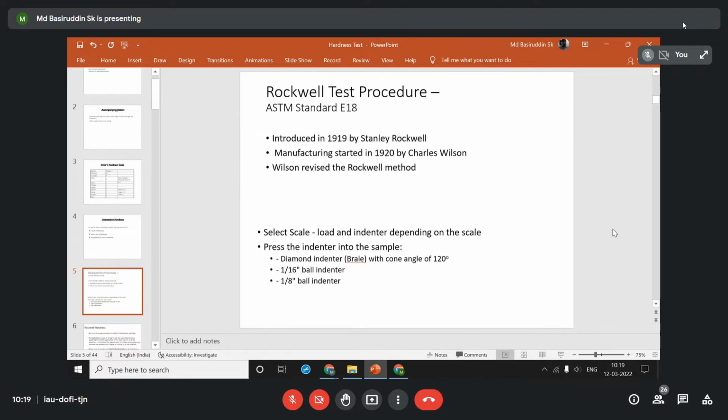Okay. Now, among all those three different types of hardness testing processes, we are only focusing on indentation hardness, where we basically apply a compressive load, and based on that we evaluate certain numbers and try to differentiate the hardness of different materials. So, considering only the indentation hardness test, we have seen that it can be carried out in different ways, by using different types of machines, and each machine has different specifications.